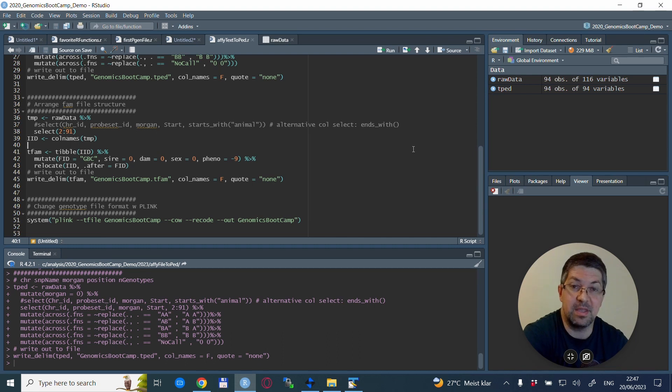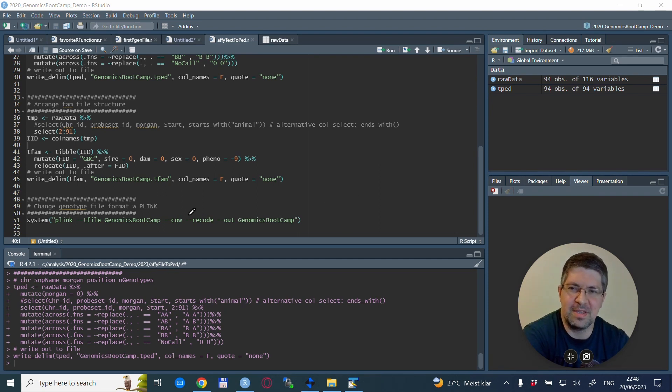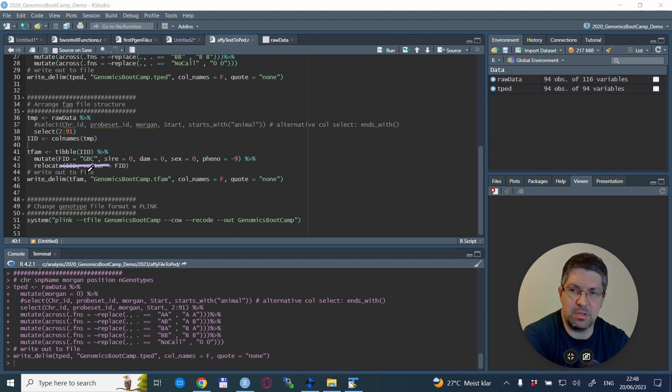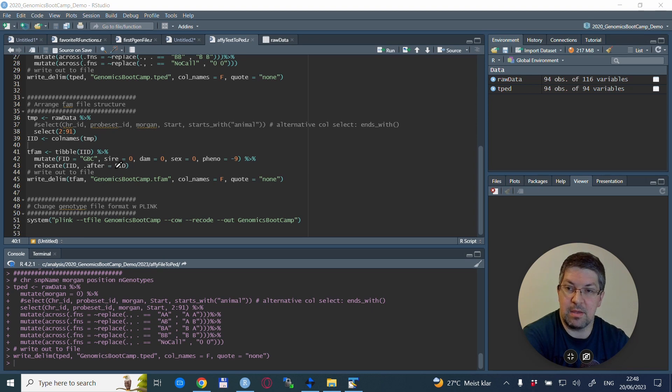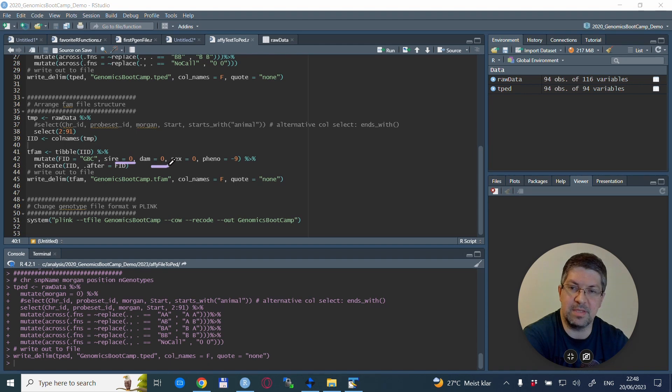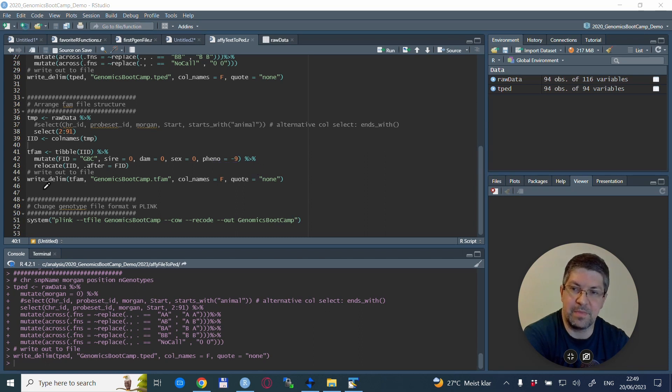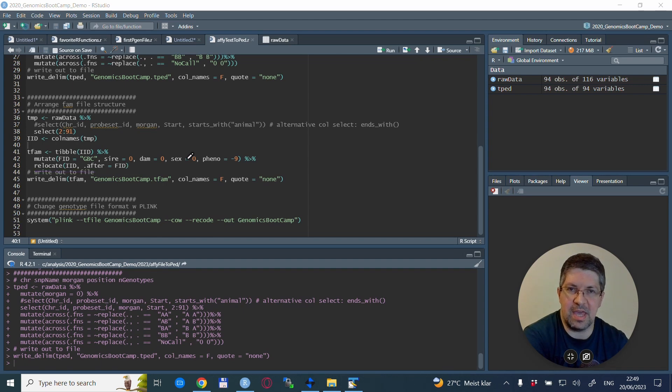So what we will need to do is extract the IIDs, or the individual IDs, as the column names from columns 2 to 91 for this particular example. That's because we have 90 individuals within these columns. Depending on your specific situation, you might also use some very helpful tidyverse options, and that is, when selecting the columns, you might use the starts_with function or the ends_with function, where you can select all the columns that start or end with a specific expression.